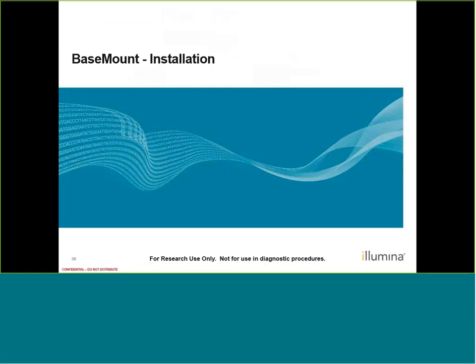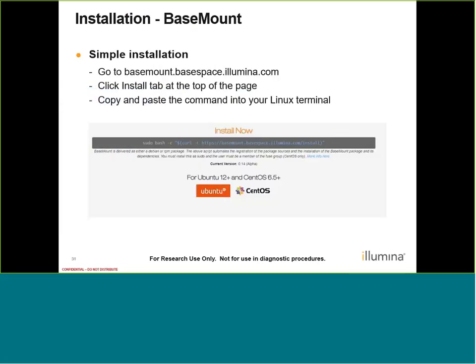Let's go ahead and switch gears and talk about BaseMount. Like CLI, let's run through some BaseMount installation and then jump into some demos. Installation for BaseMount is even easier than installing CLI. You have to go to our site at basemount.basespace.illumina.com and click the Install tab at the top of the page. That's going to show you a URL and you're going to copy and paste it directly into your Linux terminal — this is Linux specific only. You completely copy this command and that will help us install right away.